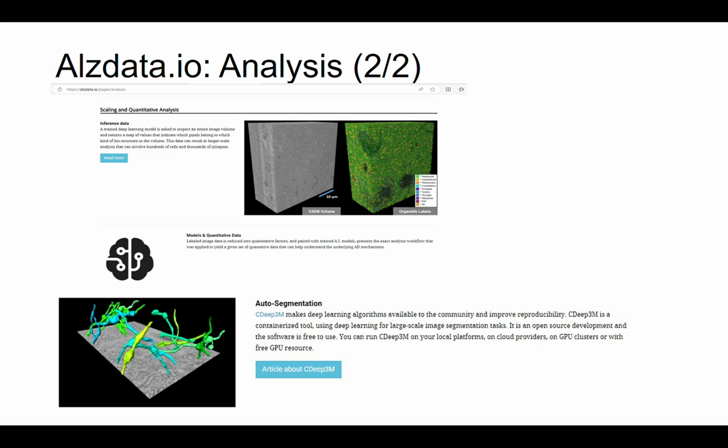Labeling 3D image data is a labor-intensive process, so we have leveraged deep learning tools to automate much of this work, significantly increasing efficiency. This automation relies on the availability of training data, which is crucial for developing effective algorithms. You can read more about the specifics of this training data we created in the first section here.